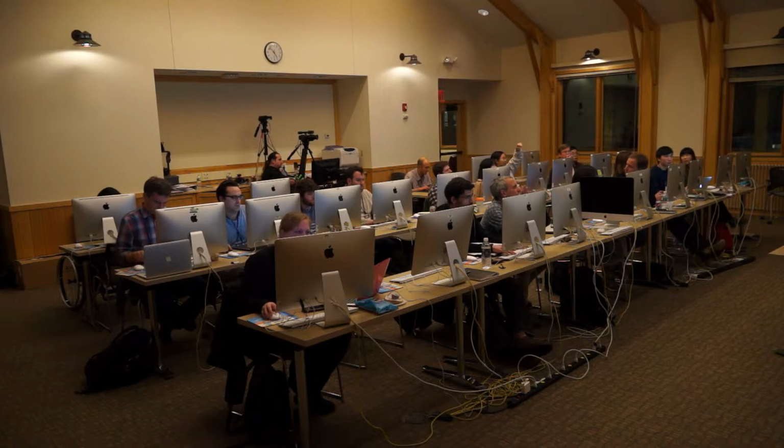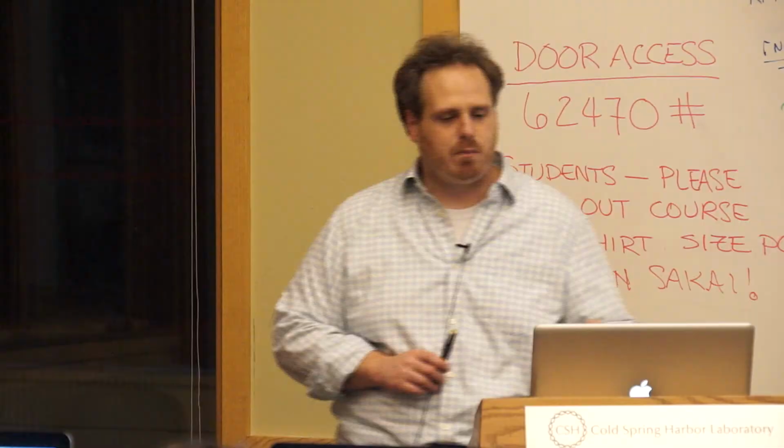So the threads option lets parts of all paths take advantage of when your computer has multiple cores in it. It's saying, go ahead and use up to four different cores. But it's totally coincidental that we got four contigs as a result. Any other questions? Okay, so let's go ahead now.